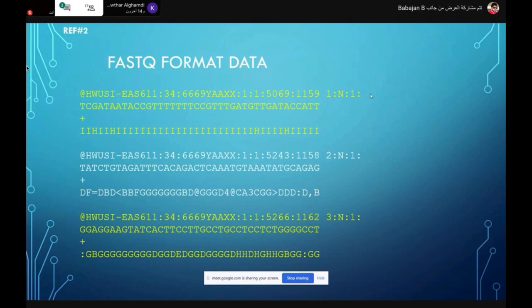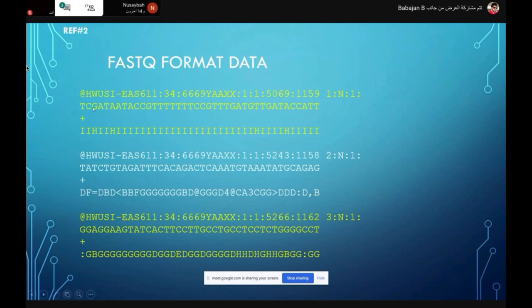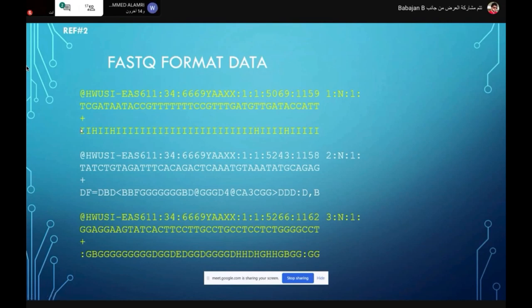The second line gives you the base calls — all the bases recorded by the machine. The third line is just a quality line break (the plus sign) — there is nothing to do with it. The fourth line is very important: the quality score, or Phred score. This tells us the quality of each base — whether it was accurately called or whether there are many false positives.